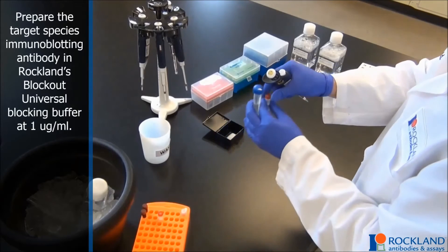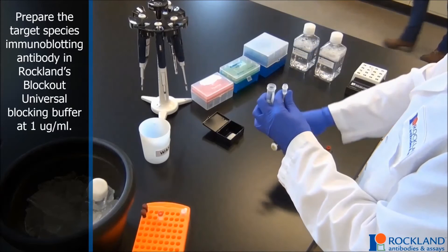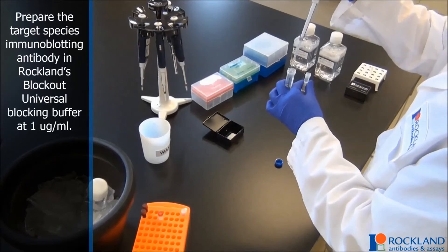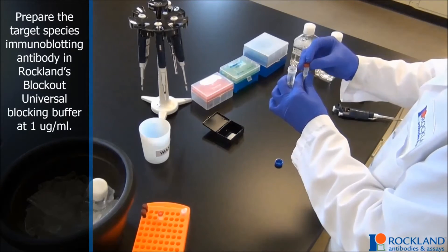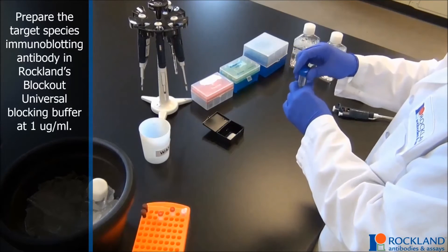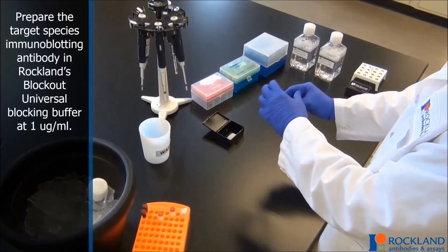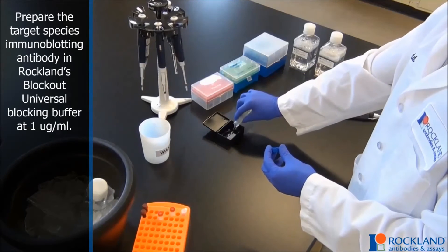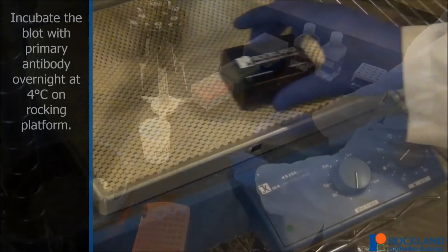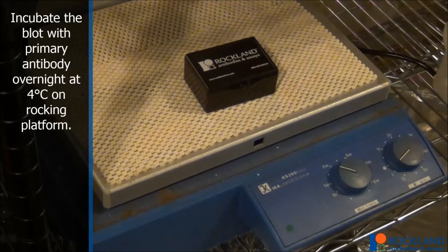Prepare the primary mouse immunoblotting antibody in blocking buffer at 1 microgram per milliliter. We recommend Rockland's Blockout Universal Blocking buffer. Incubate the blot with the primary antibody overnight at 4 degrees Celsius on a rocking platform.